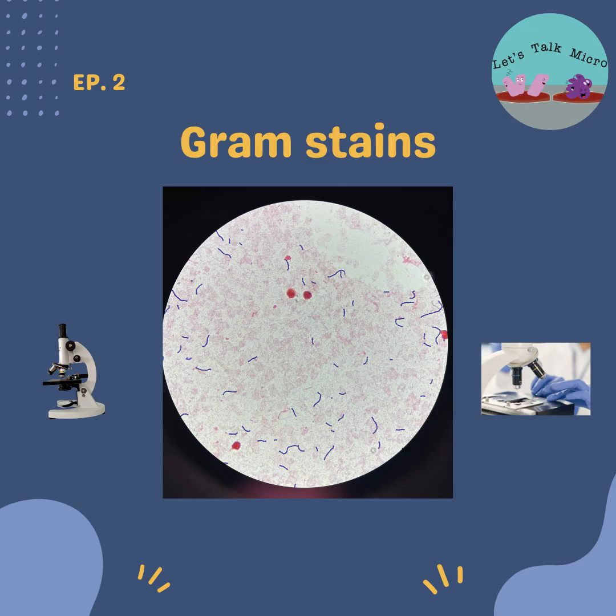Micro is not black and white. It is definitely gray. A lot of times, not everything translates so well, and you might see something on the gram stain, but then it doesn't grow on the plate. That's just the way it is. There are many factors involved in this.